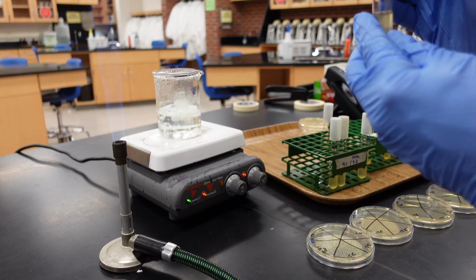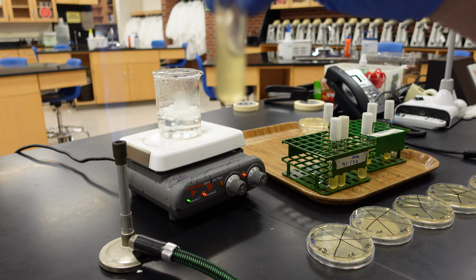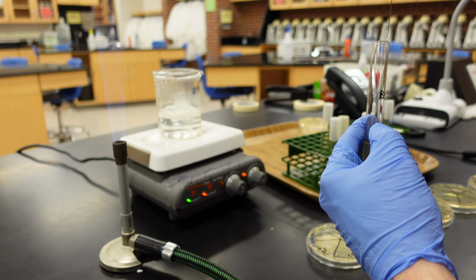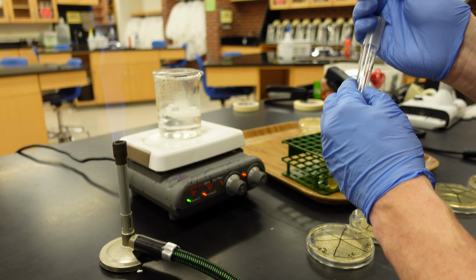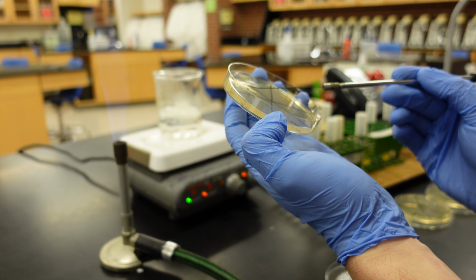I'm going to pick up the Bacillus cereus, resuspend this. You can see there's a big chunk at the bottom there. Pass that through the flame. Get a loop full of the Bacillus. And I'm going to put it on my plate, the spot labeled time zero, just a little streak of the bacteria.